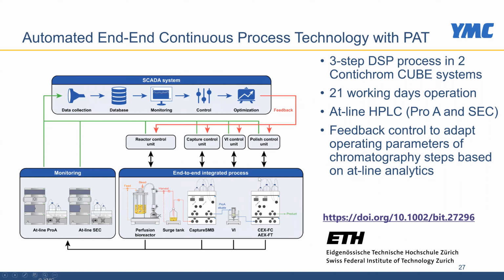ChromIQ also supports the use of multiple Contichrom systems to be controlled by one computer. As you can see here, this is a setup that has been established at the Technical University, the Swiss Federal Institute of Technology, in Zurich, as the work has also been published.